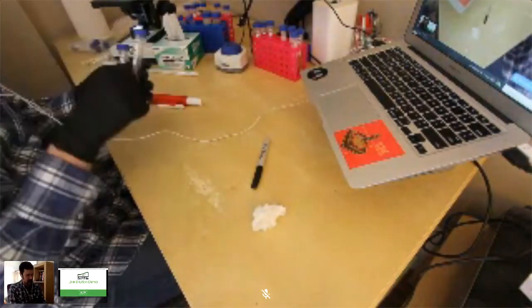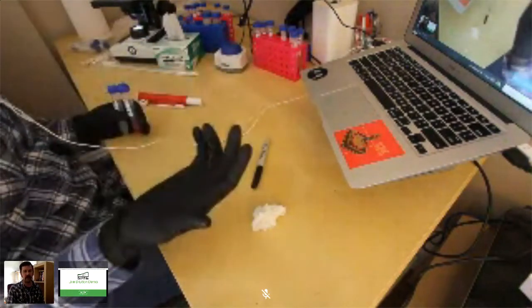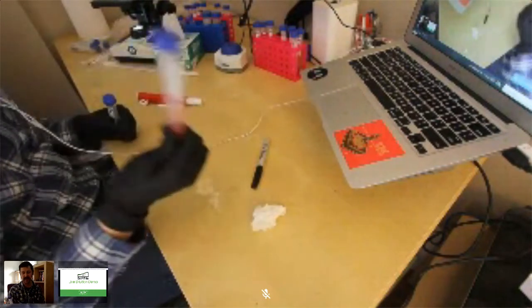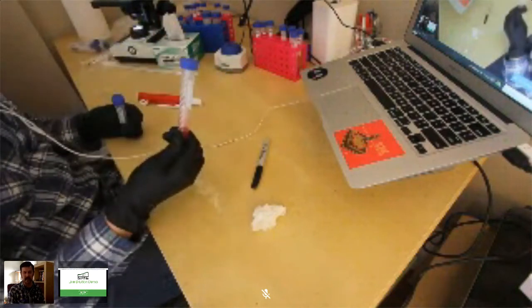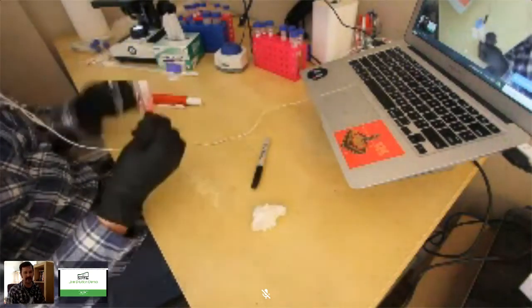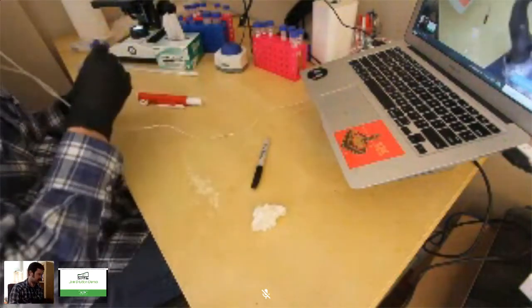Another thing with working at lower volumes with, say, a 100 microliter pipette or a 10 microliter pipette is you end up using less stain. So let's say it costs you $35 to buy your stain and you only get 100 mils. If you're doing 1 mil tests, that's only 100 samples. If you do 100 microliters, that's 1,000 samples. So you can make it last longer and you can reduce your costs.